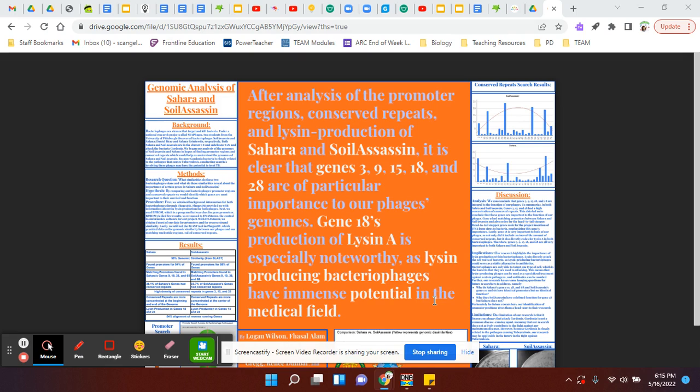In this presentation, Fhasal and Logan dive deeper into their area of interest and will be discussing their poster and research on the genomic analysis of bacteriophages Sahara and SoilAssassin. Fhasal and Logan's research focuses on the promoter regions and conserved repeats of their bacteriophages, and they utilized a number of bioinformatics programs to conduct their research in order to better identify which genes are required for survival and function.